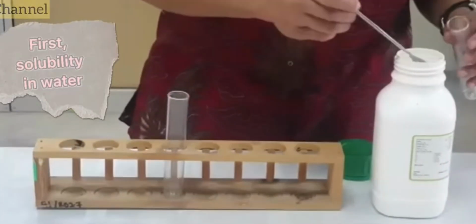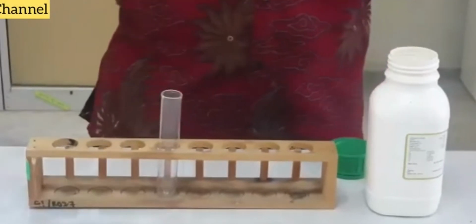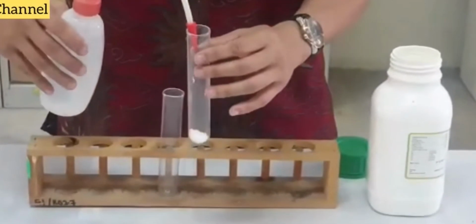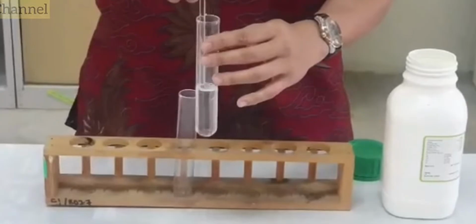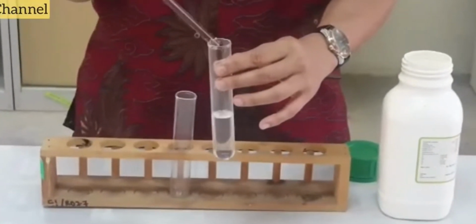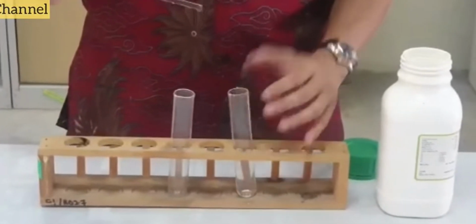Solubility of compound in water and organic solvents. First, to test the solubility of the compound with water, take some of your magnesium chloride into a test tube using a spatula and pour in some water. Then take a glass rod, stir the mixture together, and see. It all dissolves in water.